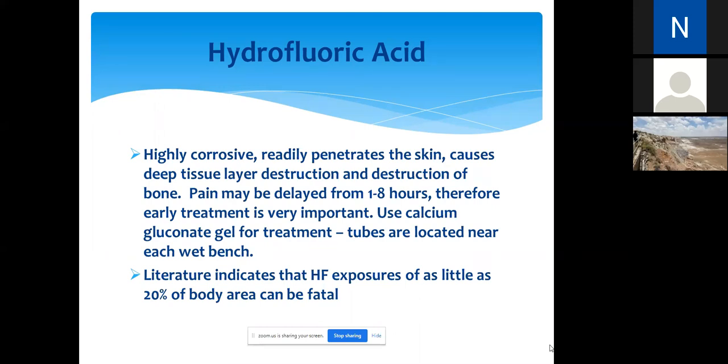And if you are doing all that and you still end up with a spill of hydrofluoric acid on your skin, how I don't know, but okay, you have the spill on your skin, make sure you rinse with water. Apply calcium gluconate gel, which should never be too far from the place where anybody would be using hydrofluoric acid. Get out of the clean room with an SDS for hydrofluoric acid and go and seek medical help.